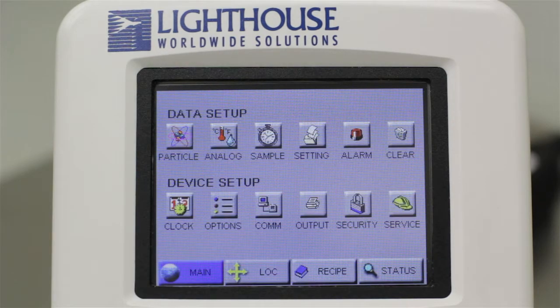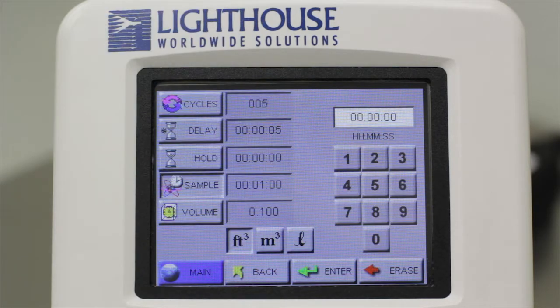Next, touch the Sample button and you are brought to the Sample Configuration screen, where you can set the current sample configuration.